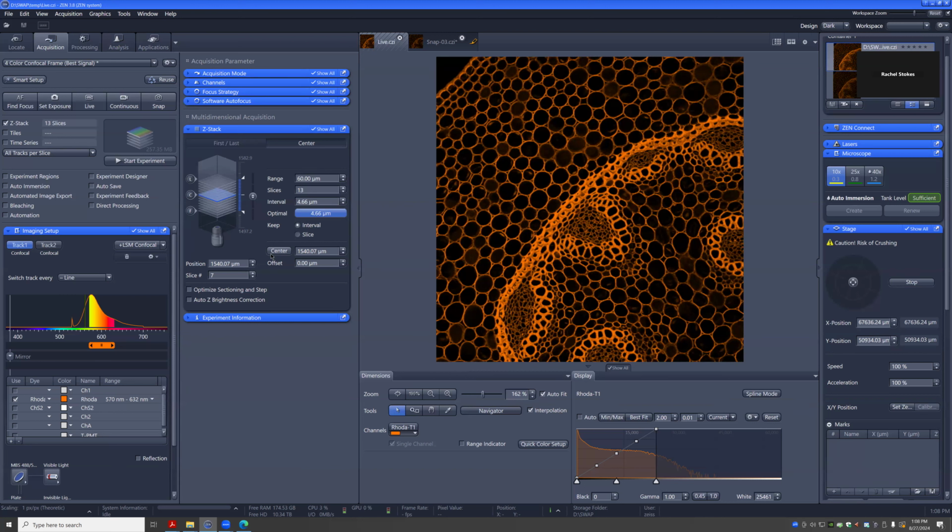So once you start building experiments into something bigger, right, using multiple modalities, it's important to have that center mode. You can also enter center. So here, I just realized there's two center. So this is one that shows you the menu. And then if you hit this button, that'll set the center.